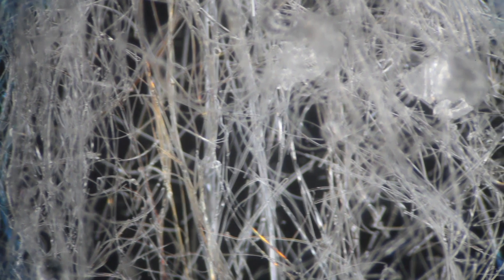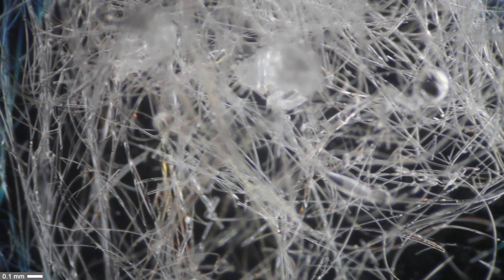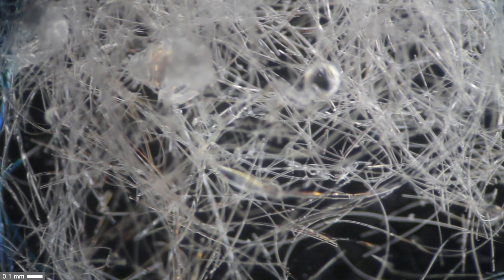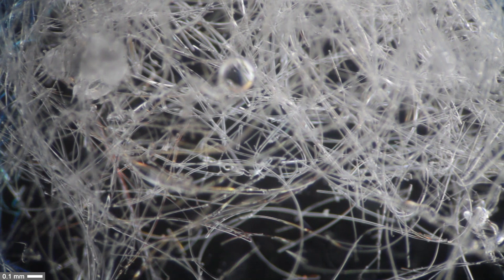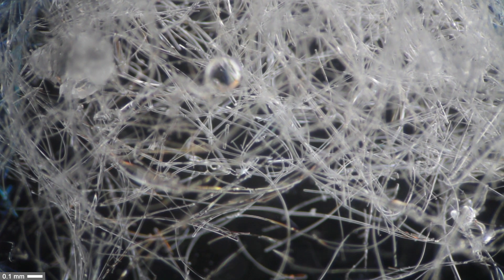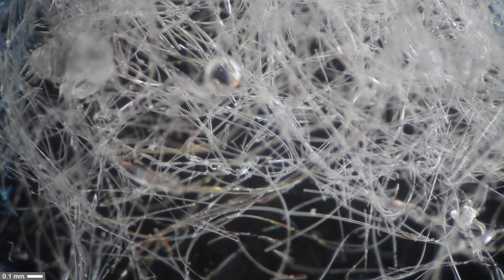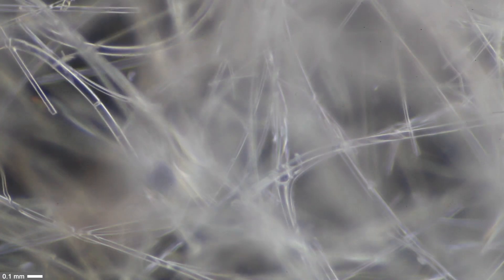We're using the 4x magnifying objective and we can see the individual cotton candy fibers. This is dark field, so you see the individual fibers bright on a dark background because I included a patch stop filter in the condenser.